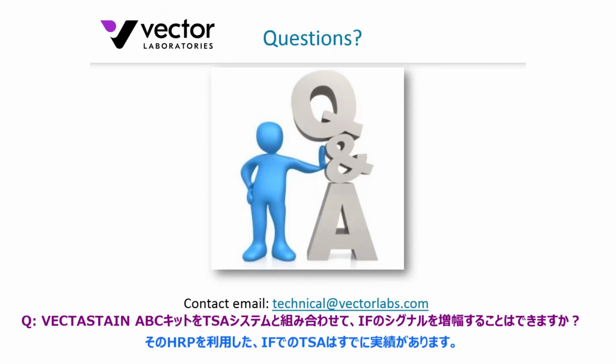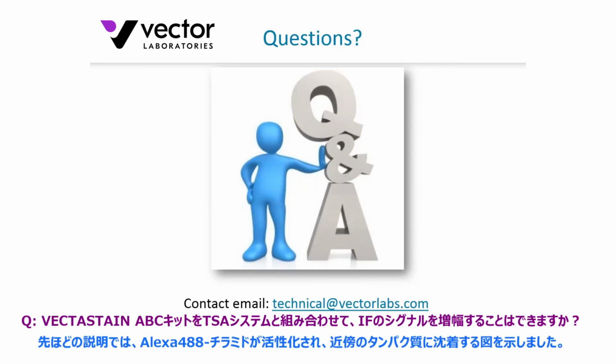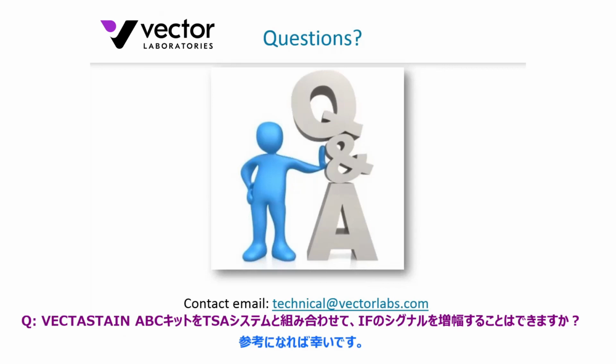their immunofluorescence. So basically you'd put on your primary antibody, your biotinylated secondary antibody, the ABC kit, and then at that point you'd introduce the tyramide conjugate. In the case we showed earlier on, it'd be an Alexa Fluor 488 tyramide to then activate the tyramide to precipitate down at the site of localization. So there certainly are publications out there and references where investigators have used the ABC kit to get a very sensitive detection methodology for immunofluorescence. So yes, you can certainly do that. Hopefully that overview gave you a bit of an idea.